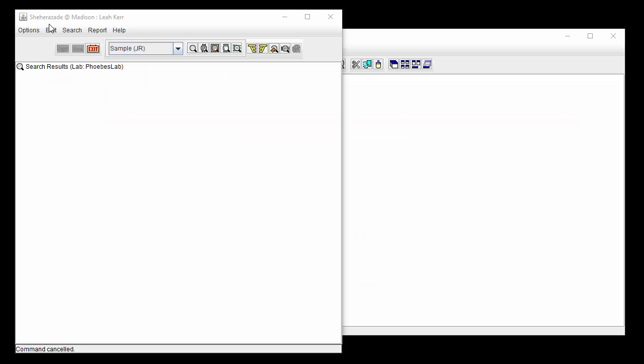Sesame's Citation View is used to store a lab's manuscripts, publications, and other materials that may be cited later. It may also be used as an internal archive to store a PDF library of all publications used by or relevant to the lab. Let's create a new citation.